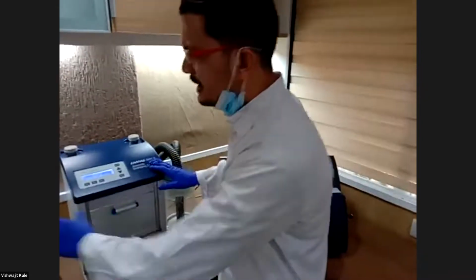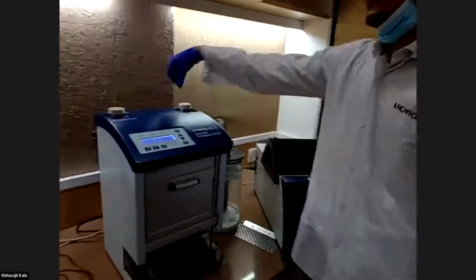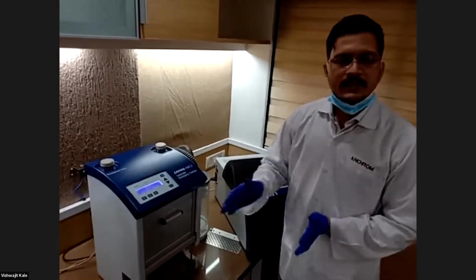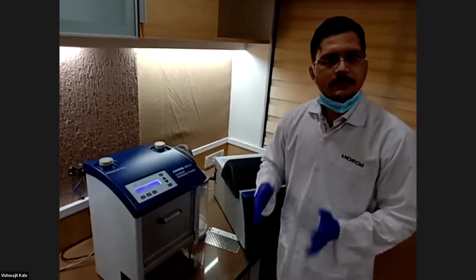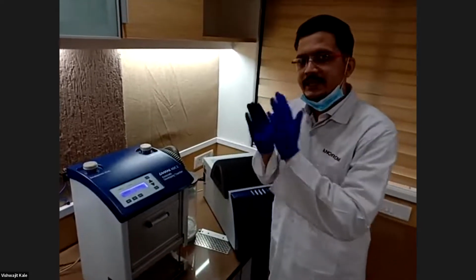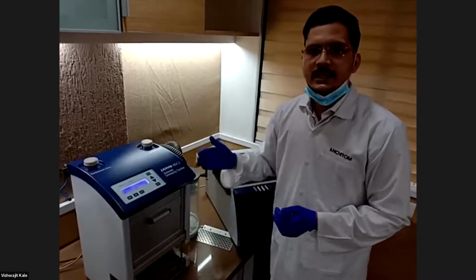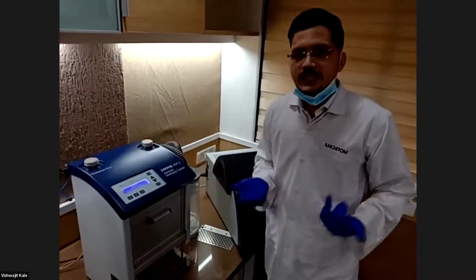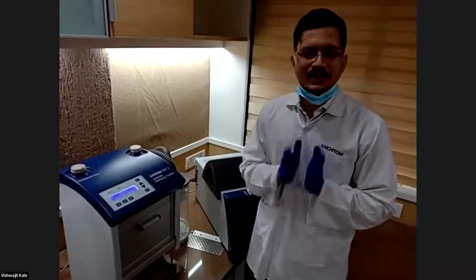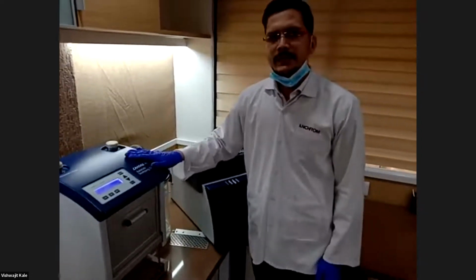So after giving command from software, this is software control. We just need to hang plate here, keep the chamber here, pour in the mobile phase, and give command from the software. So plate drying after chromatographic development is automatic. Automatic solvent front monitoring system is also there. Sensor is given which will sense the wet portion of the plate. After reaching exact 70 mm or 80 mm solvent front, whatever given in software, it will take out the plate from the chamber automatically. And plate drying is also user independent and automatic in ADC2. So for reproducible results, plate to plate, day to day in control environment, we need to use ADC2, CAMAG ADC2. So this is all about chromatographic development module ADC2.